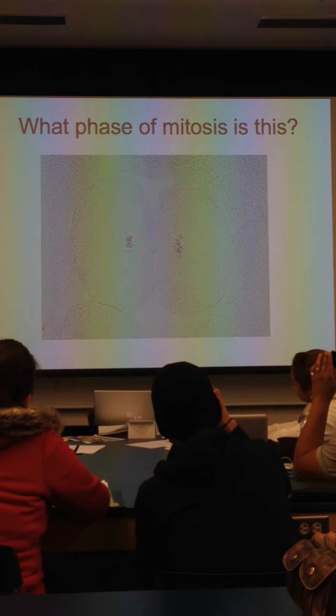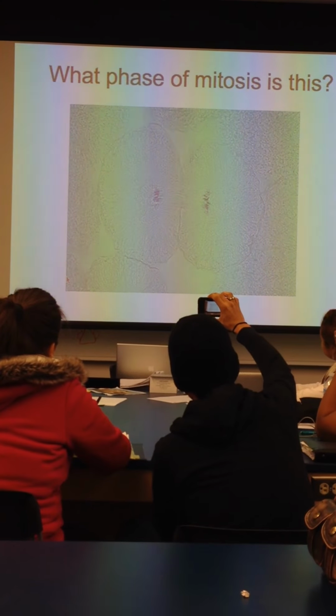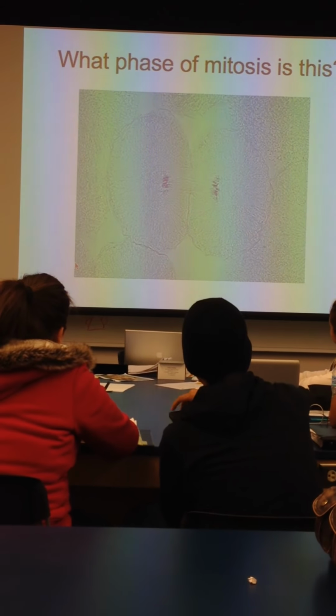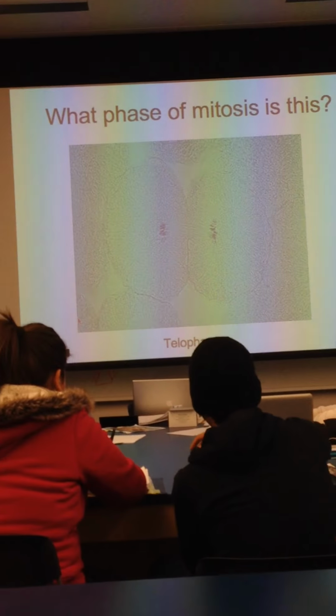So, what phase of mitosis is this? Telophase. Okay, you can take your pictures at any time. This is telophase. How do we know this is telophase?